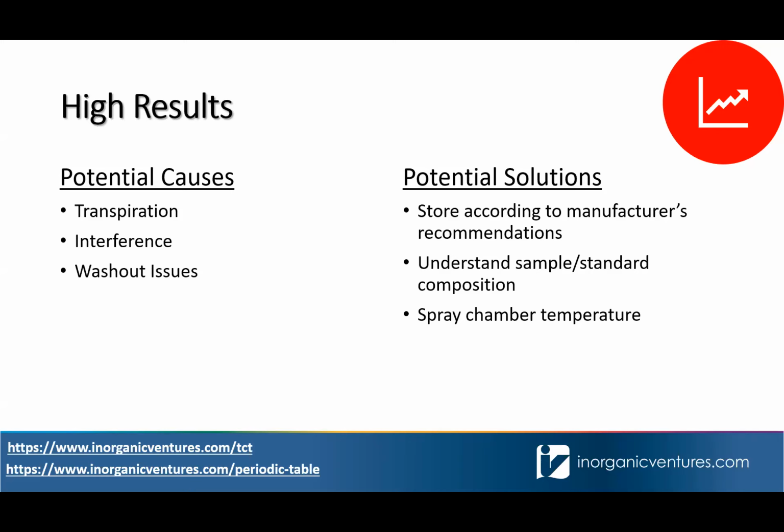So this one is also a little bit troubling, is you're getting a result that comes out a little higher than you expect. So potential causes could be transpiration with your solution. It could be an interference in your analysis, or it could even result from a washout issue. So you had something that was stuck on your tubing, and now all of a sudden it's part of your solution flowing through when it's not actually part of your analysis.